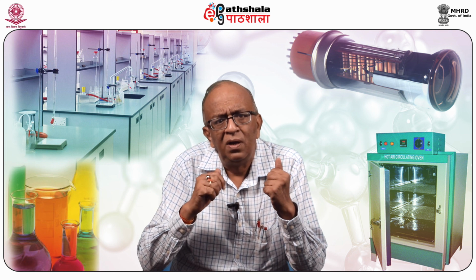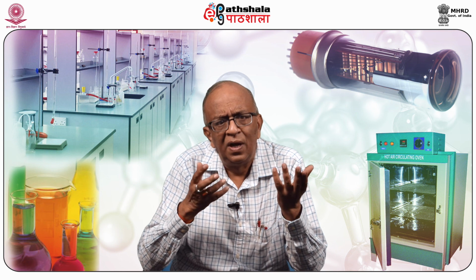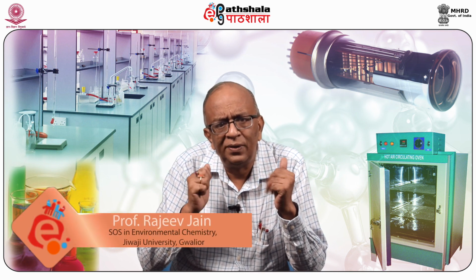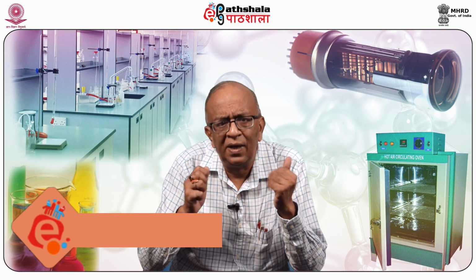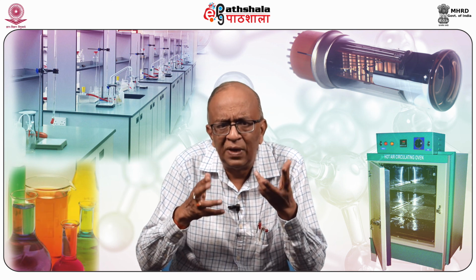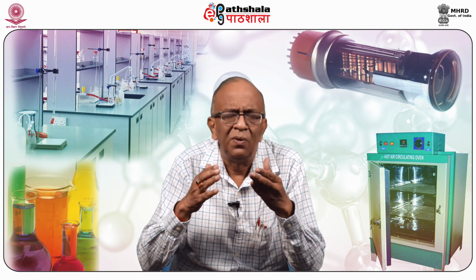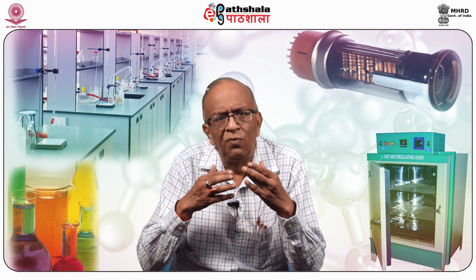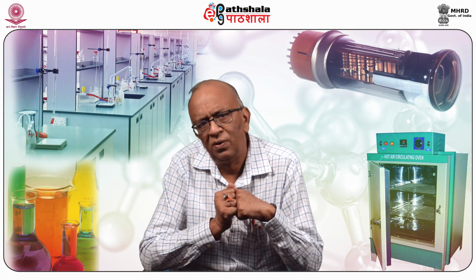For example, different types of analyzers include typical process analyzers, oxygen analyzers, colorimetric analyzers, moisture analyzers, infrared analyzers, elemental analyzers, gas chromatographs, and mass spectrophotometers, all of which can be interfaced with the different types of reactors and processes taking place. Different types of methods are used in process control, as you have seen in this module. Thank you.